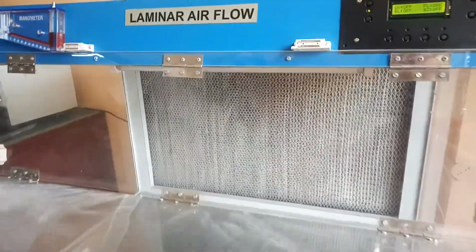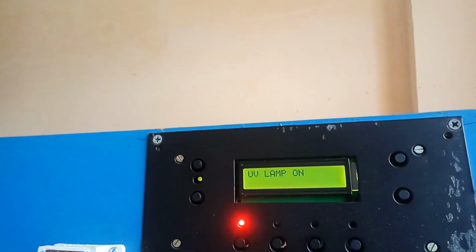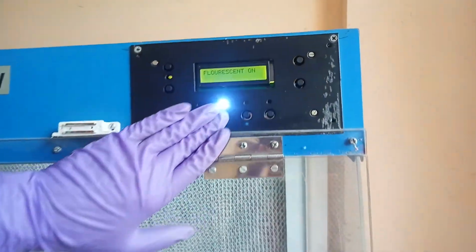Normally how it functions is, we keep it closed and then we switch on the UV. If you can see now, the UV light is on inside, and as a result all microorganisms present inside will get killed. We'll leave it on for a certain time, and after the sterilization process is done, we switch it off, and then we switch on the working light inside.